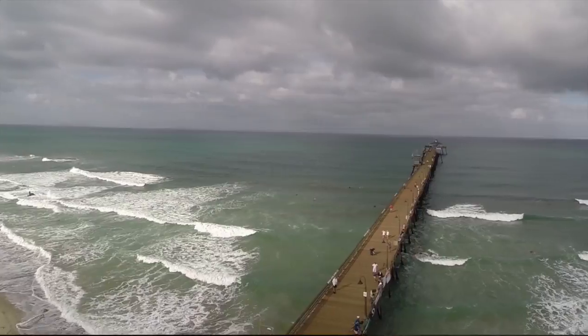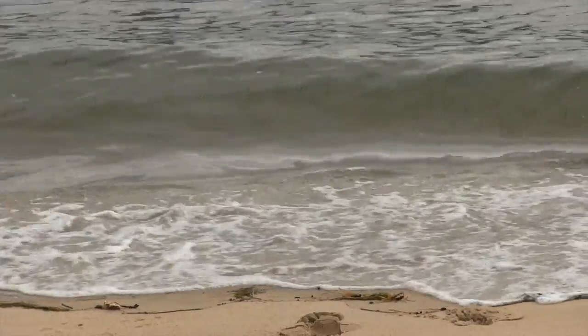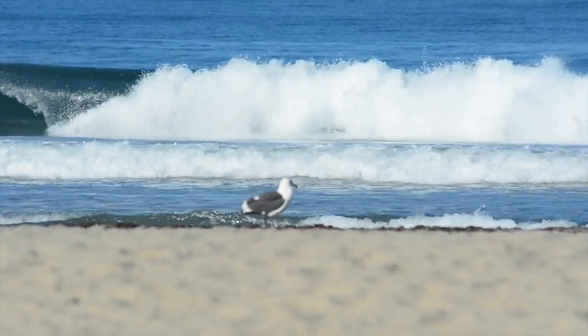The first thing you will test for is turbidity. Turbidity measures the water's clarity. Debris, sand, silt, and other materials can make the water less clear or more turbid. Turbidity can impact the aquatic ecosystem by affecting photosynthesis, respiration, and the reproduction of aquatic life.